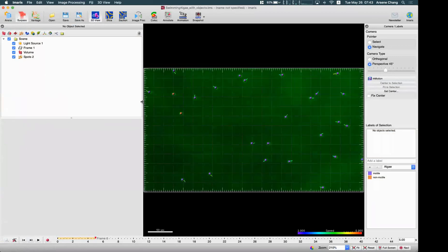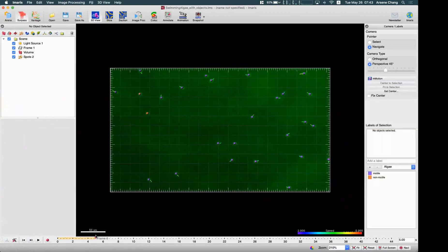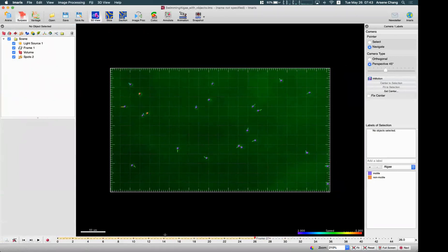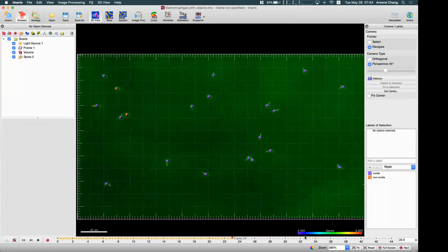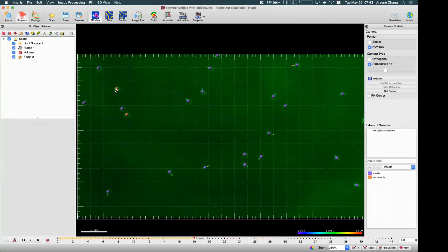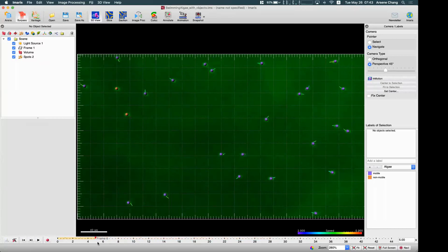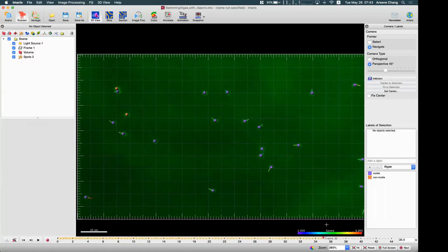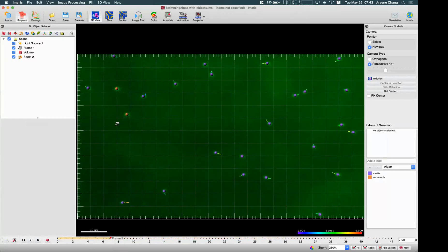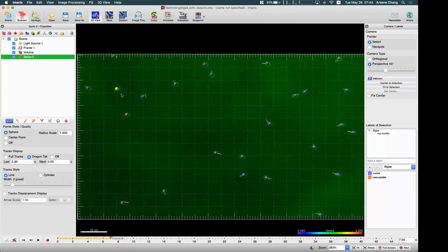So let's go back to these 2D datasets. In this swimming algae sample, which we demoed last week, we have tracked the movement of these algae. If you notice, there are two objects which are basically not moving, so we can use these two as an example to do the drift correction. We already seen there's not much drift, so even if I correct with this result, you may not see an obvious change. But I will show you using the other object.